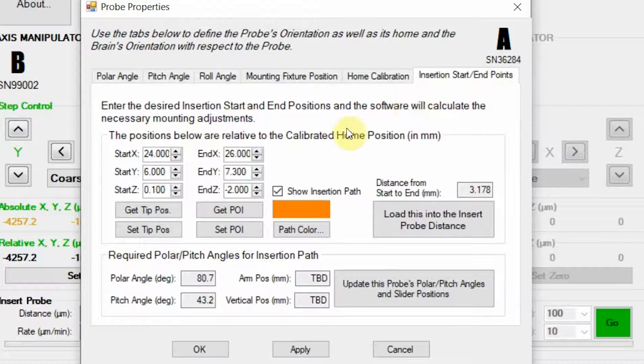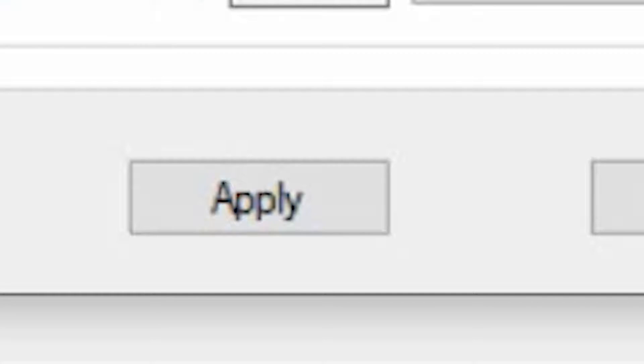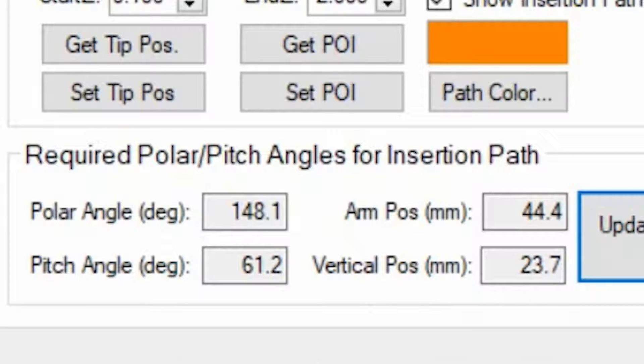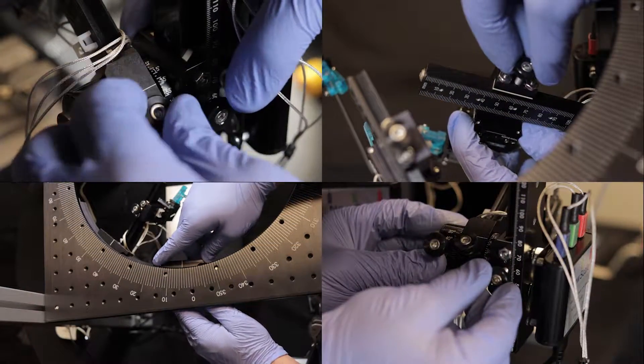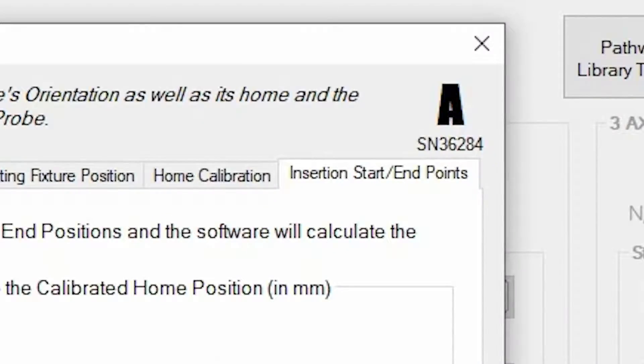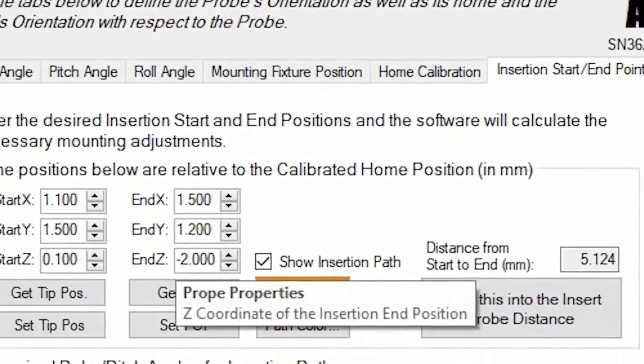Once the system is calibrated, you can indicate the brain atlas start and ending points you wish to reach. The program will then calculate the NPM arm position attributes required to reach the correct probe trajectory. You can then manually set these attributes on your NPM system. Unique start and end points can be set for each probe.